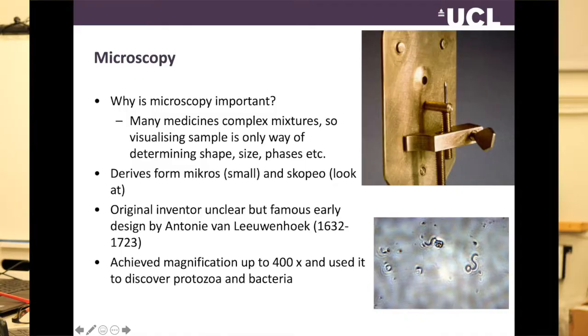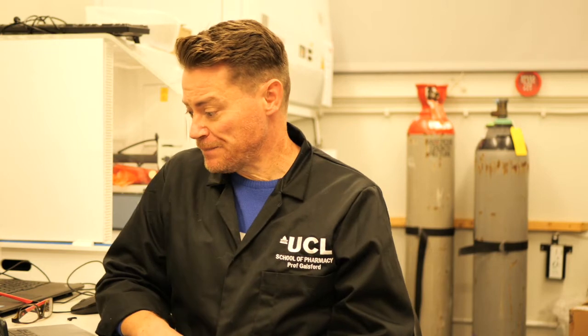So the first thing is, what is microscopy? And I'm sure you're aware it simply means imaging a sample and imaging in such a way that it becomes a lot bigger so that we magnify that sample and we can see small details as part of it.